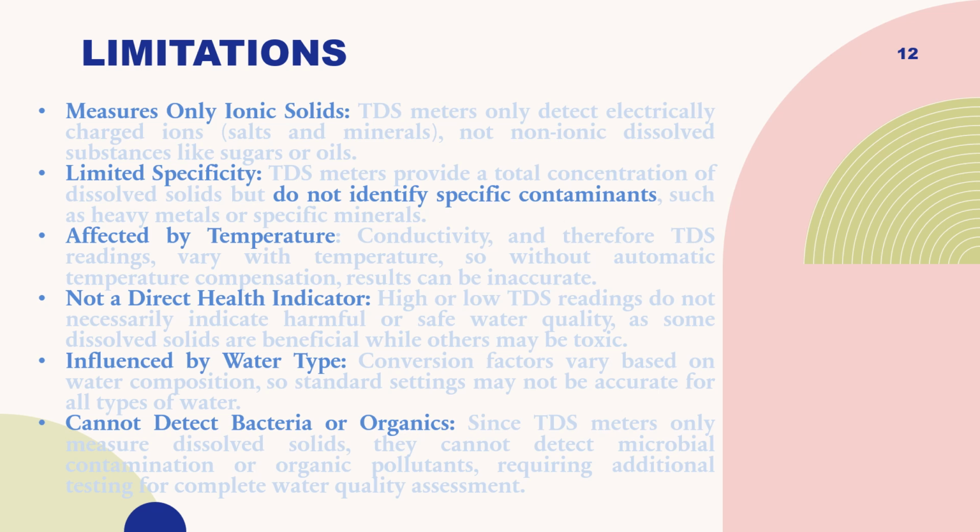Affected by temperature. Conductivity, and therefore the TDS reading, varies with temperature. So without automatic temperature compensation, results can be inaccurate. Not a direct health indicator. High or low TDS readings do not necessarily indicate how harmful or safe the water is, as some dissolved solids are beneficial while others may be toxic.